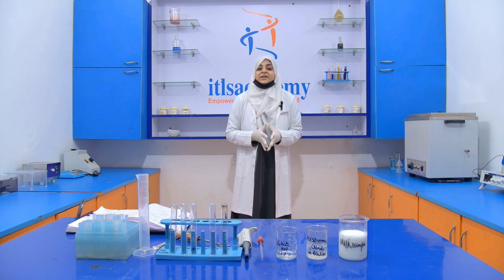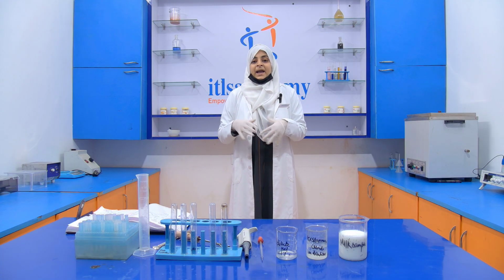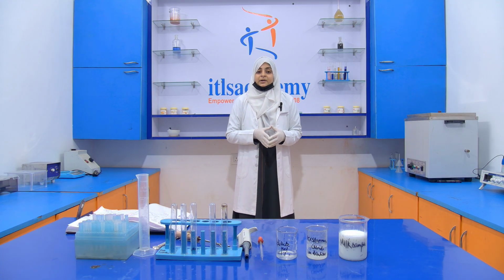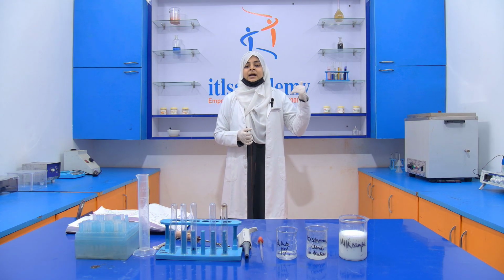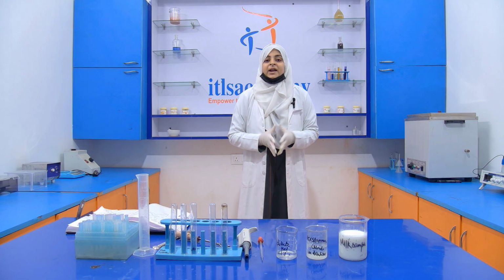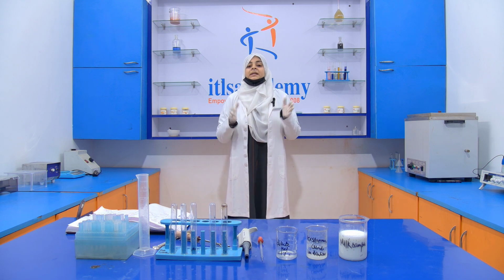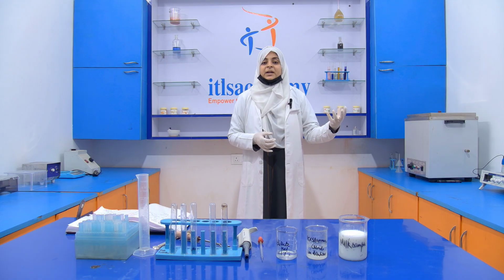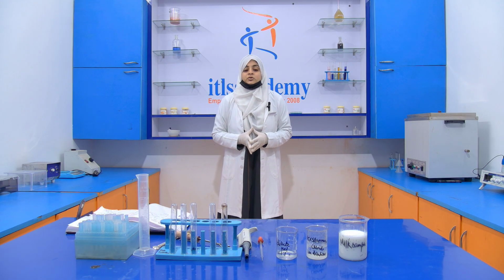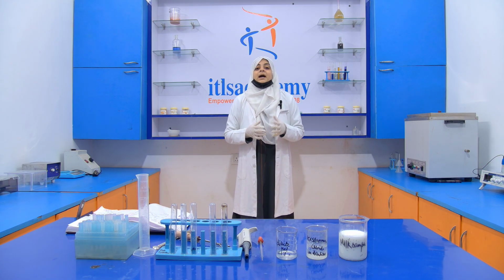Now why does this preservative act as an adulterant? See, when an excess amount of the preservative is added into the food product, then that preservative has a harmful effect, and it comes under the category of adulterant. The FSSAI has a list of permitted preservatives and their limit values. If we add the preservative beyond that limit value, then it will act as an adulterant.